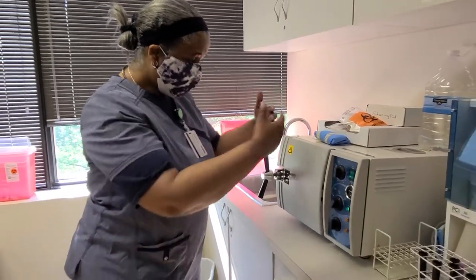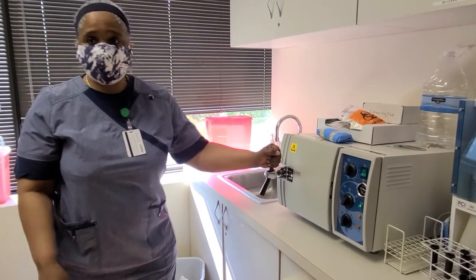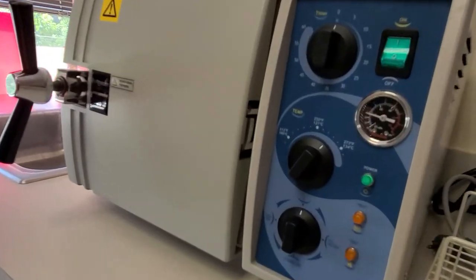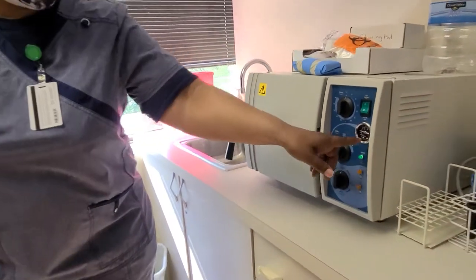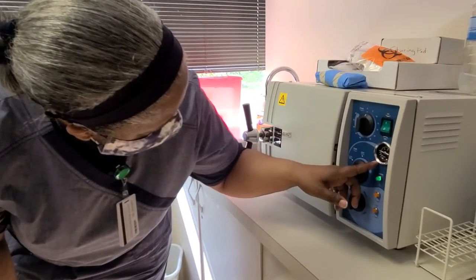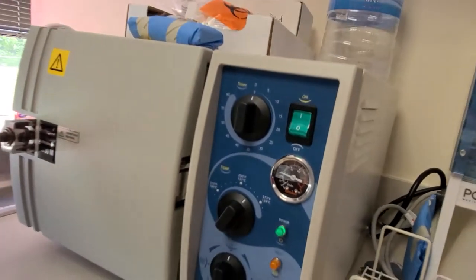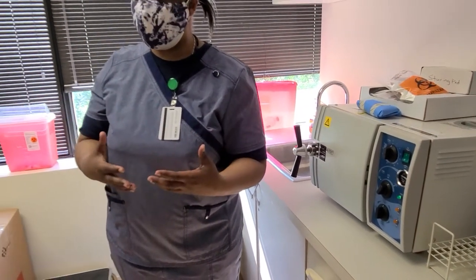After it dings and I'm all done, I literally cannot open this, because one thing I have to do is turn it from sterilize to extra dry. The machine has to decompress because the pressure has really built up in there. You can't open this up while the temperature is too high. So we're going to look to make sure the temperature is somewhere in this lower area right here, between 30 and 40. Every autoclave is a little different, and sometimes they'll give you a range of where you can allow it to go before it's decompressed enough for you to open it.